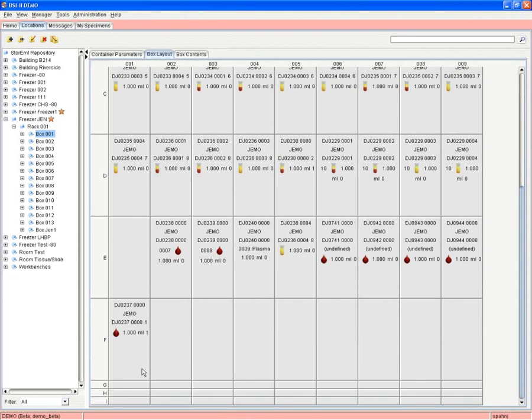And you can move specimens that way. So you really have to kind of hold the mouse key down for a second, and then drag. We don't want to make it too easy to do. So those are the changes, the easy changes, very, very quickly.